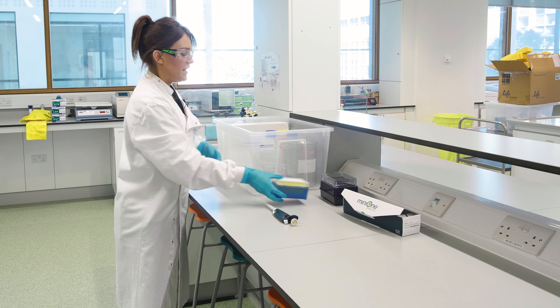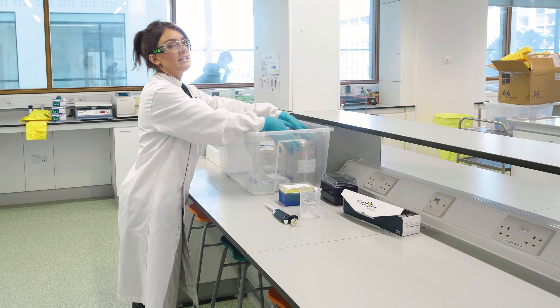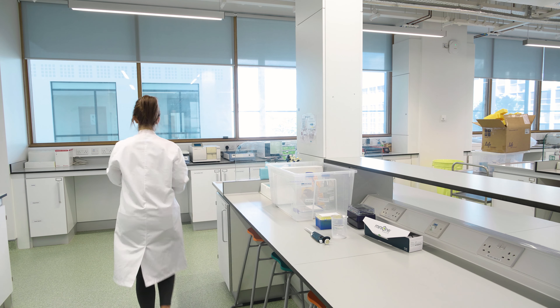You'll give them a box of tips and a small waste beaker. At the end of the class, all the waste beakers will go into this waste beaker with the lid. You can also leave this at the top of your desk.